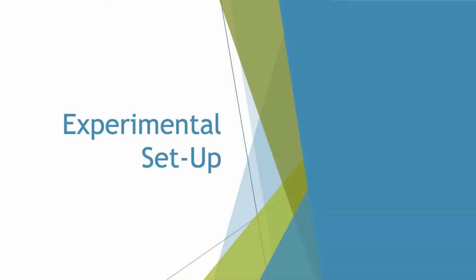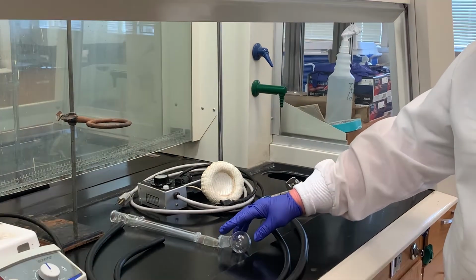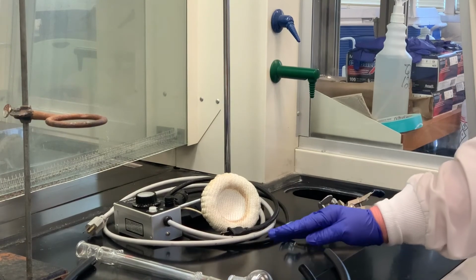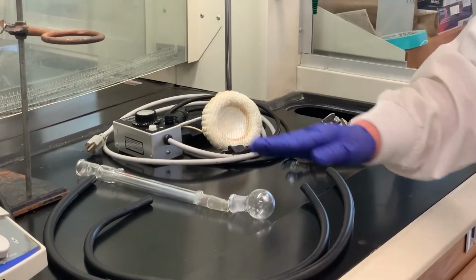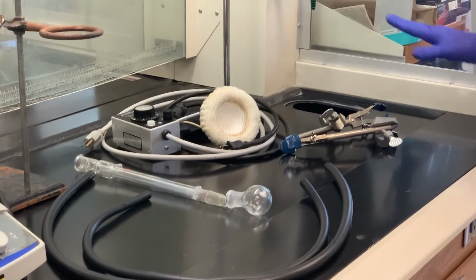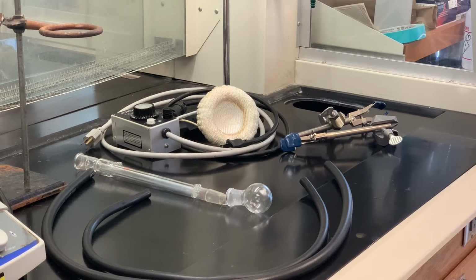Equipment needed for today's lab, the formation of benzocaine. We're going to carry out the reaction under reflux. We're going to use a 25 milliliter round bottom flask. Of course, we need a stir bar. We've got our condenser, tubing for the condenser, and obviously clamps. We're going to use a heating mantle today in order to carry out this reaction.